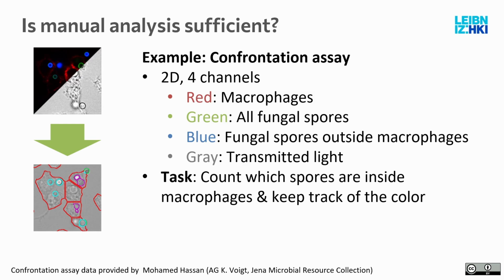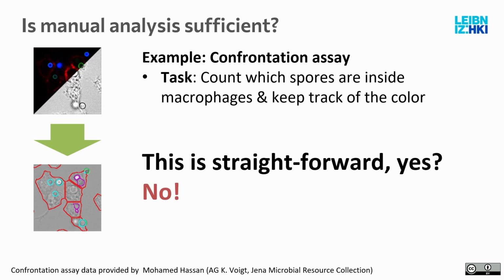And then make use, for example, of this red channel. And here's an example of such a segmentation. This was done automatically, but of course you can imagine you can do this in something that can annotate your data, and then you do it manually that way. And as a side note, a lot of this was actually done manually by the person who did this, counting the cells.